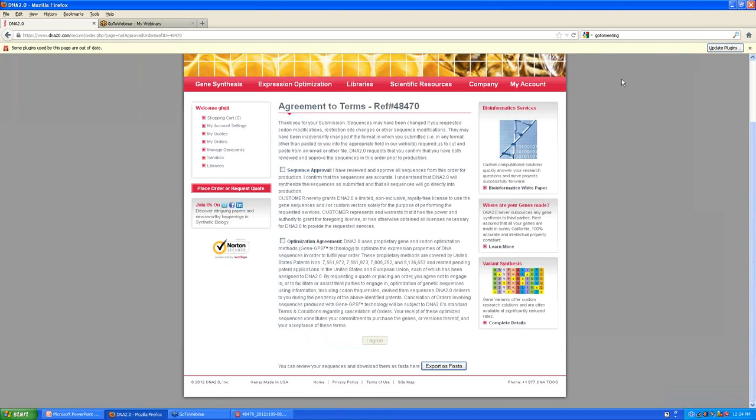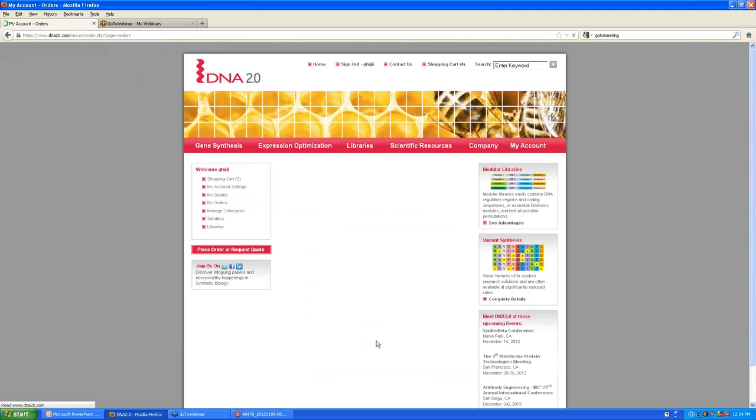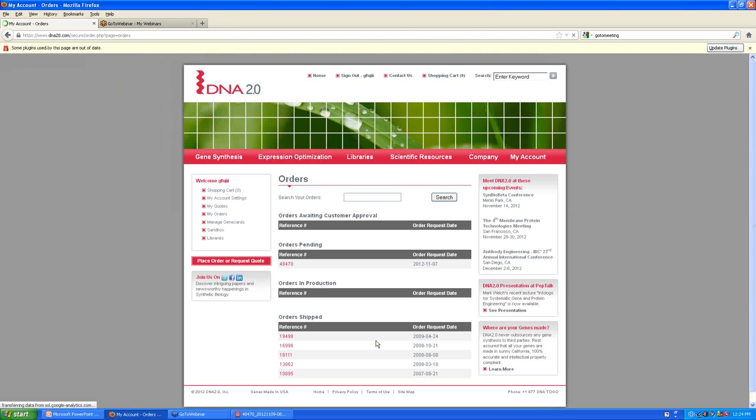Assuming everything checks out just perfectly, you want to go ahead and click these two buttons and then click the I Agree button. And what that does is notify DNA 2.0 that you've reviewed and approved the sequences, and it's good for production.